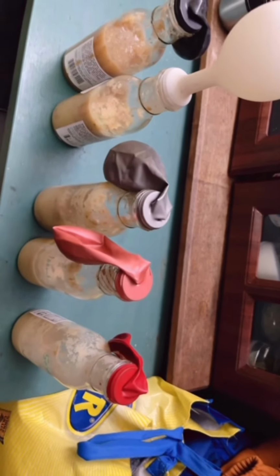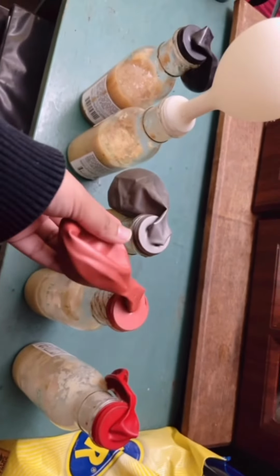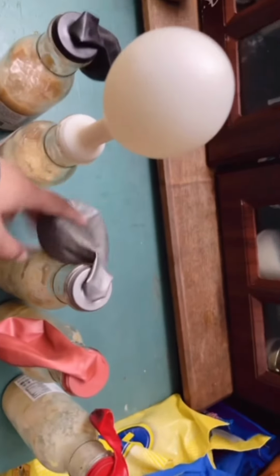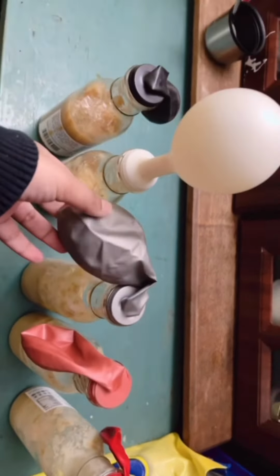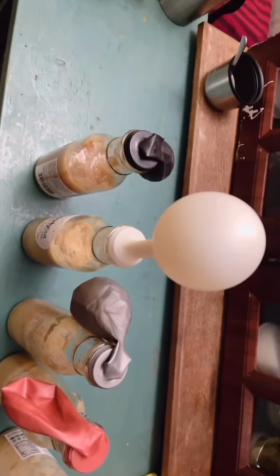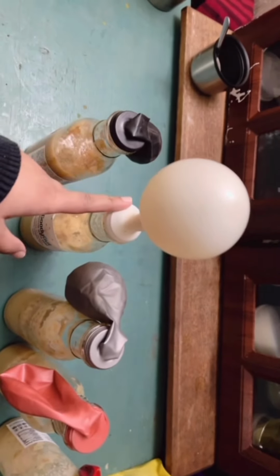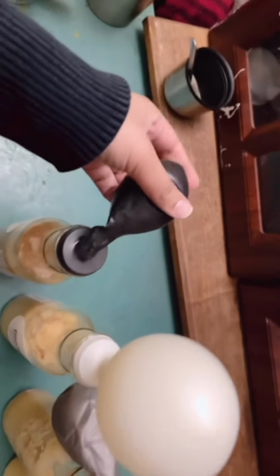The results are kind of expected, since the bottles with less amount of sugar, 50 ml and 100 ml, formed negligible amounts of carbon dioxide. However, with 150 ml it formed a significant amount, but it was very little compared to 200 ml. When the sugar was present in larger amounts for yeast fermentation, there was more carbon dioxide formation. For the control, there was very little carbon dioxide formation, as in the previous week. For 50 ml, it was negligible, 0 ml of carbon dioxide formation. So we started from the 100 ml sugar container.